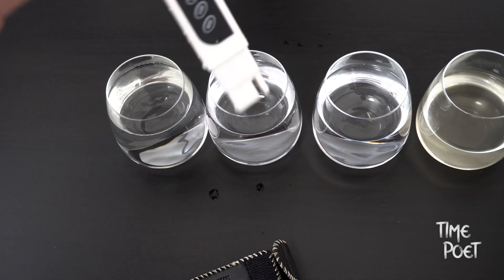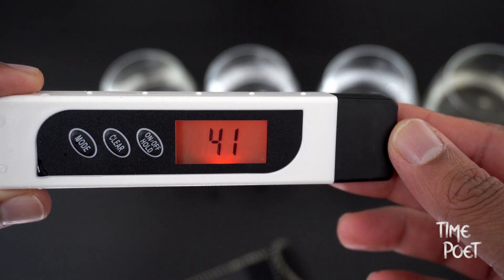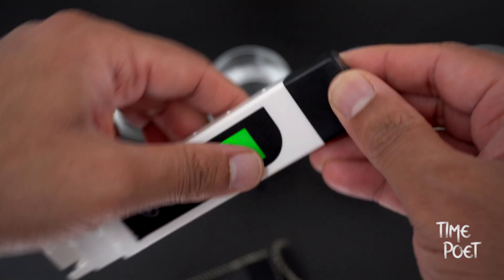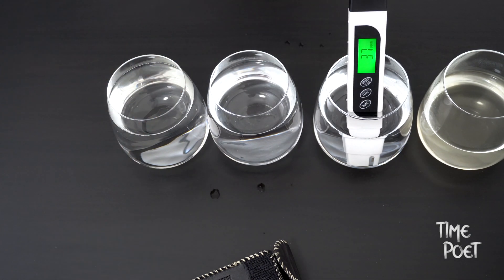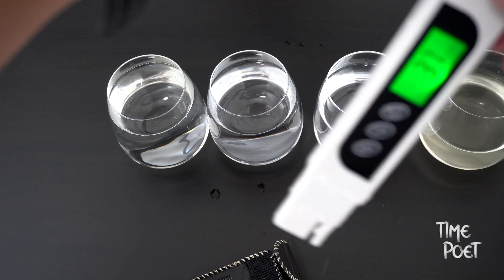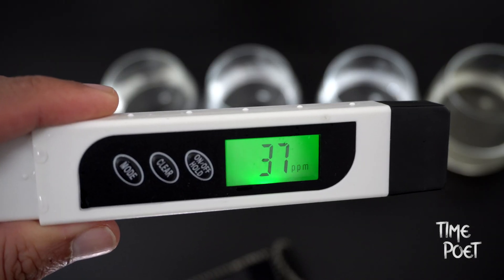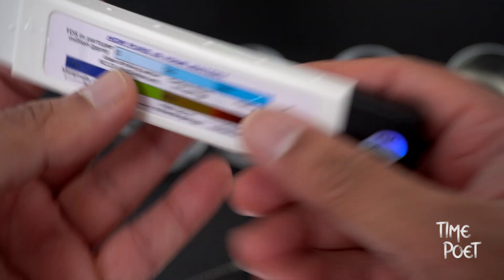Let's clear this and have a look at the next sample, which is bottled water. That's given us a value of 37. Both of these sources — the filtered tap water and the bottled water — were well within the safe limit.